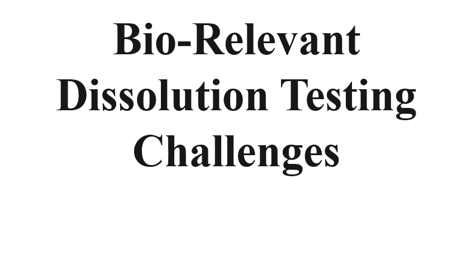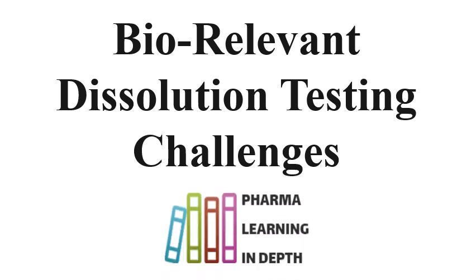Dissolution testing is a quality control test, and it is performed at all stages of product development, starting from research and development, technology transfer, then site transfer, SUPAC changes or variations, till the life cycle of the product. The dissolution testing is crucial.